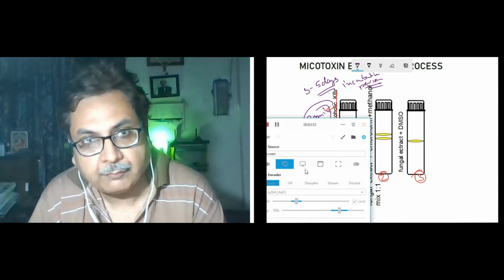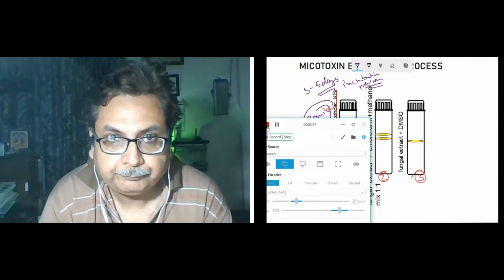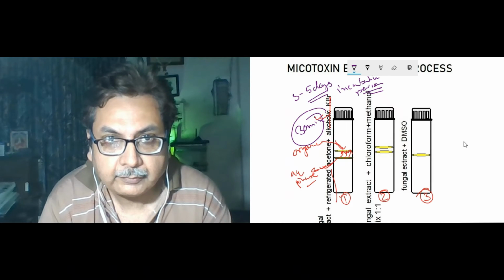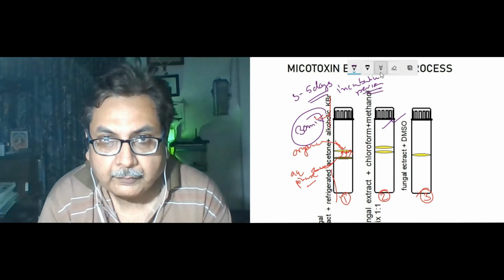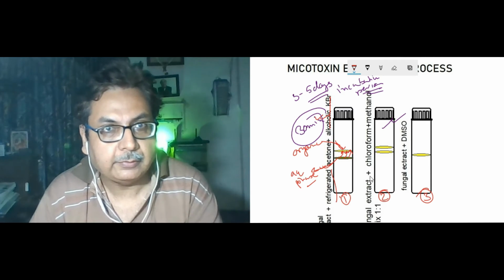Otherwise your fungus will be lost, and your mycotoxin will be lost. So you have to keep this in mind.